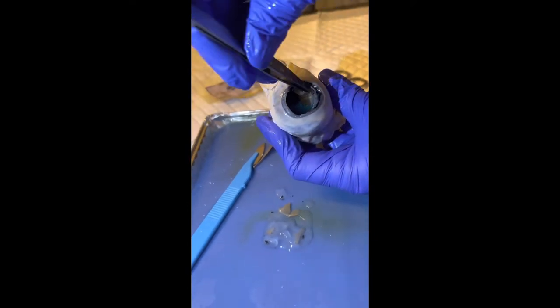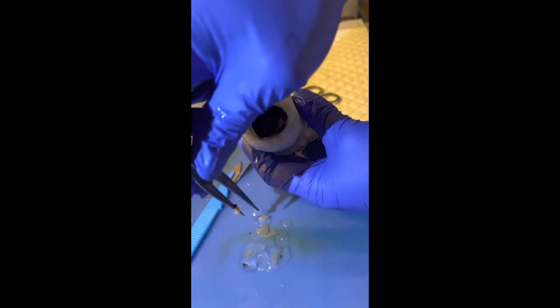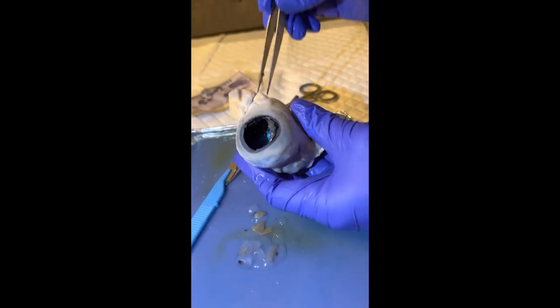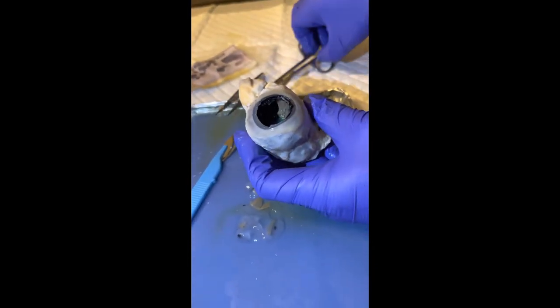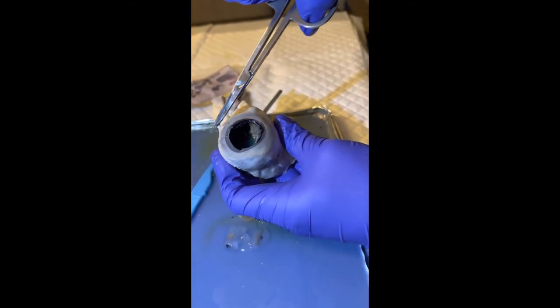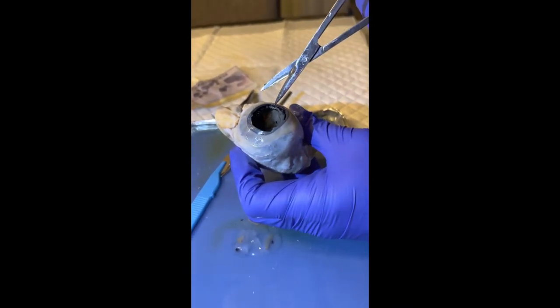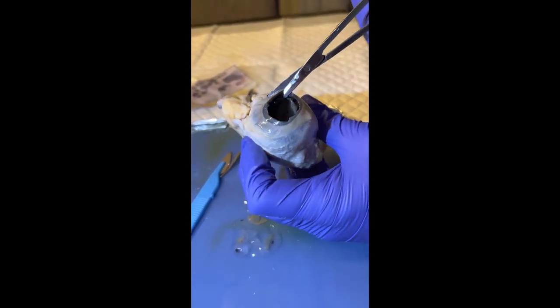These sensory neurons allow both humans and animals to see in low light situations, while the cone cells help to see in color. After reshaping the actual eye with my scissors, I was able to notice the retina begin to detach itself from the walls, moving inward and proving to be just another thin cell layer.